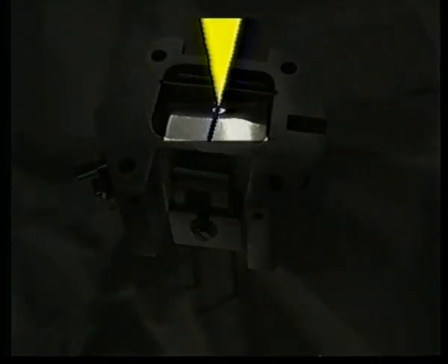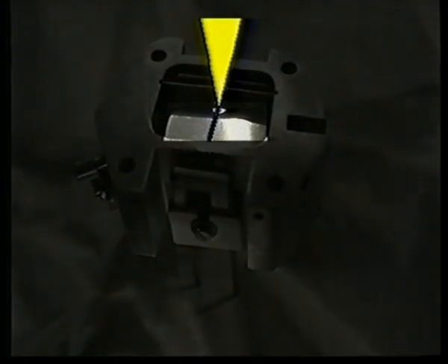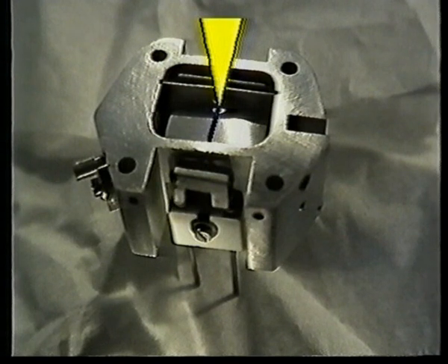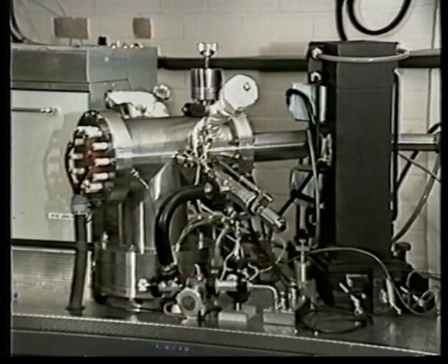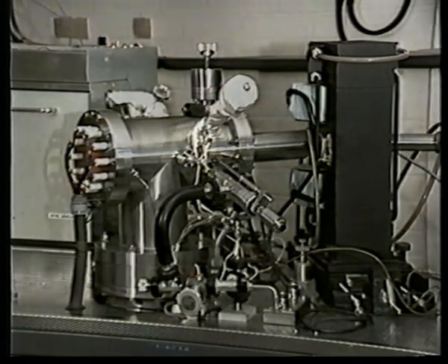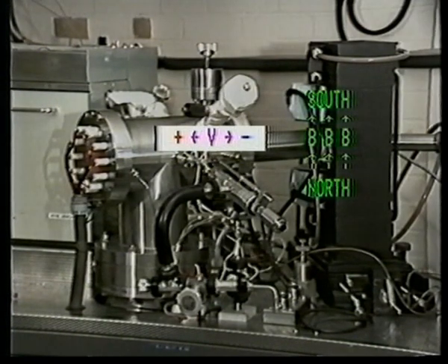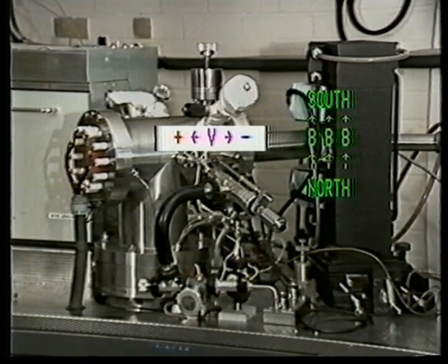You can see the positive repellor plate highlighted here beneath the electron beam. The iron block, of course, is normally at right angles to this when the source is inserted into its housing. So the ion beam actually travels horizontally along the tube towards the cathode. The ion block and cathode are approximately in this position when the source is housed within the mass spectrometer. The high voltage V between the repellor in the ion block and the cathode accelerates the positive ions to high velocity. These ions travel on towards the vertical magnetic field of the electromagnet where they are deflected towards the detector.